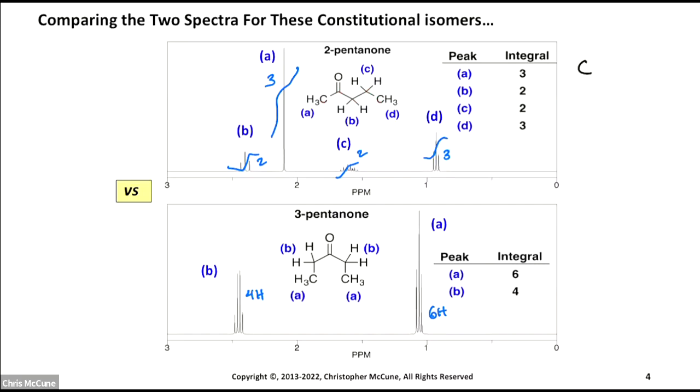So we've got C5. Count the number of hydrogens, and you got 3, 5, 7, and 10. And then we've got an oxygen. And so if you count up the integral numbers, that tells you how many hydrogens total in the structure. And that's the idea, because the signals are due to the hydrogens.